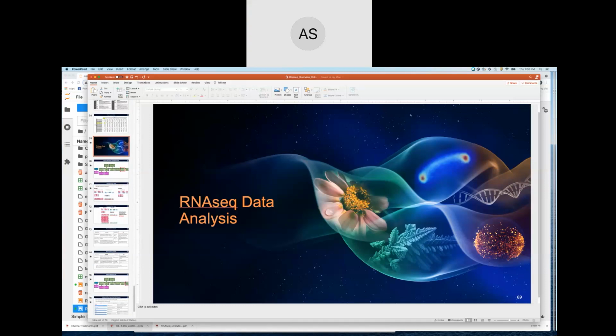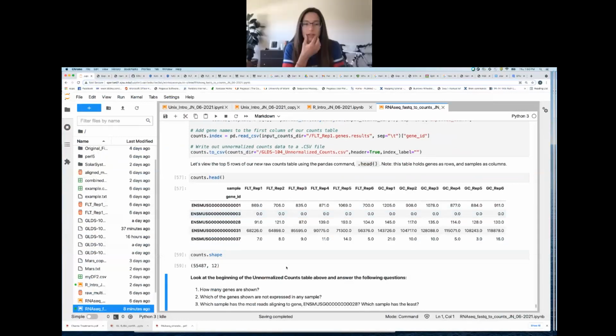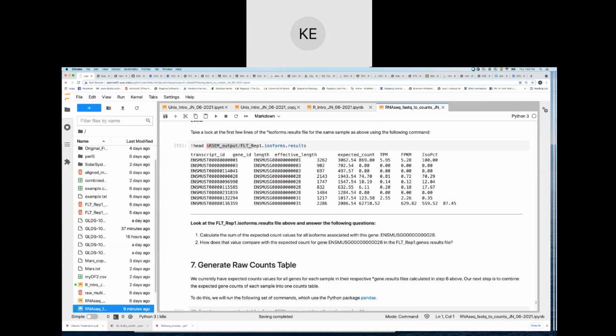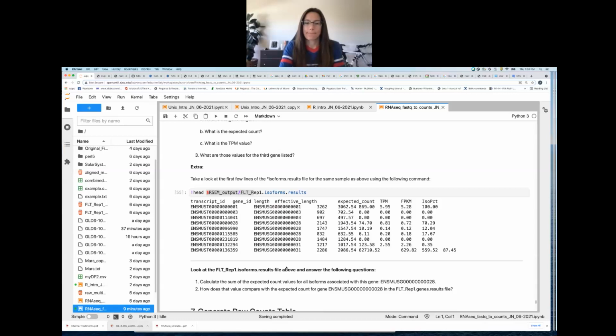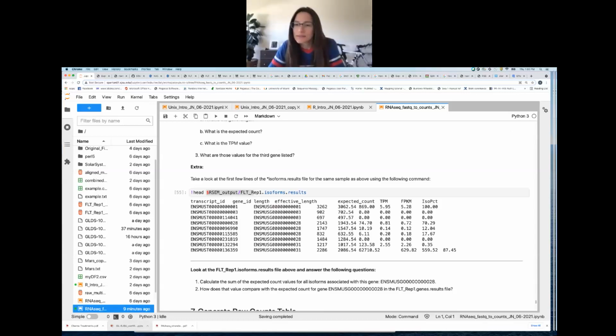You're trying to figure out how to convert the isoform results table into pandas, right? I think I have the code for that. Oh, to combine this for the isoform table? Oh no, from section 6? We're trying to figure out how to convert it. Yeah, I got the code for that. Awesome, put it in the chat. Okay, so you did import it to a variable. Cool. And it is a lot cleaner. It's easier to read too.